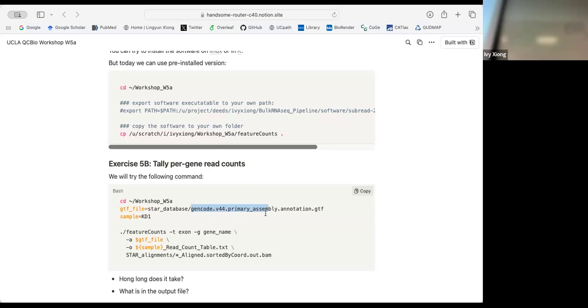Oh, is this finished? Yeah. Oh, I see, I thought it might be complete. That is incomplete. So what you can do is change the star. Oh, that's the star. You do that for all of them. Okay, got it. Yeah, and then I would just have to do it again with the SE one, when the SE one finishes. Okay, oh, this is without the... oh, so, wait, then. Oh, cool. Yes, so you can try the one.